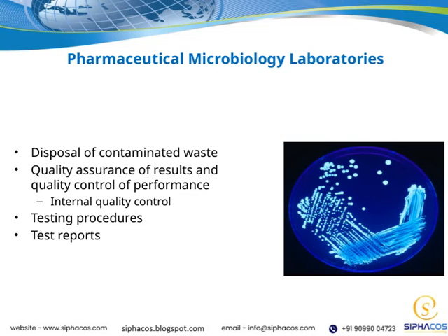Now, let's look at some essential aspects of pharmaceutical microbiology laboratories. First, the disposal of contaminated waste is critical to prevent any cross-contamination or environmental issues. Proper procedures must be followed to ensure safety and compliance.